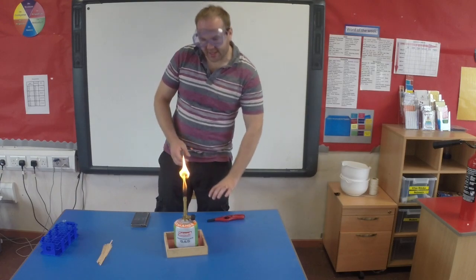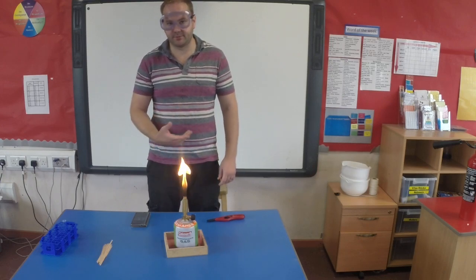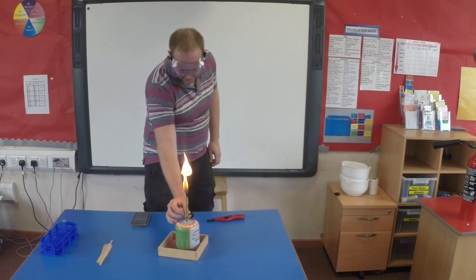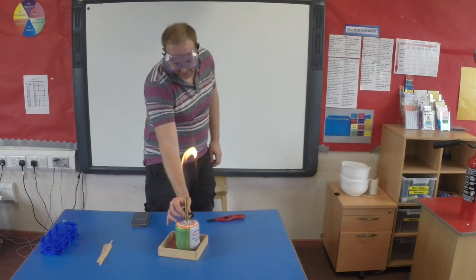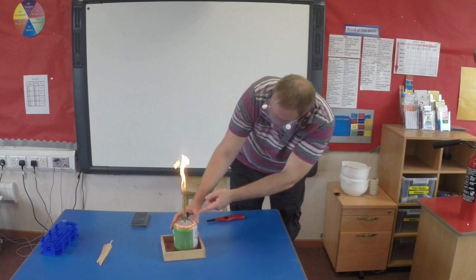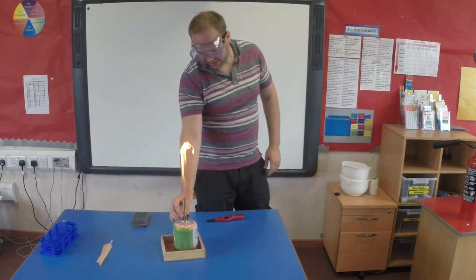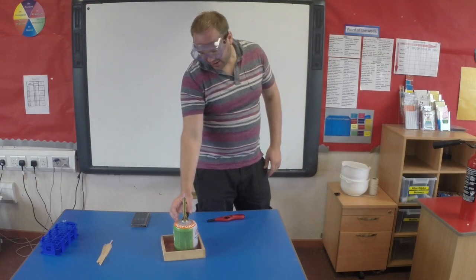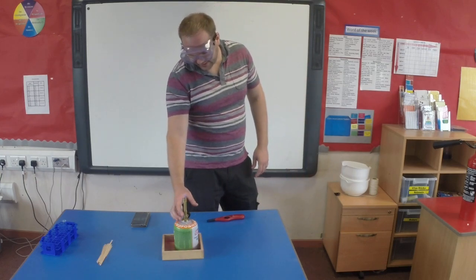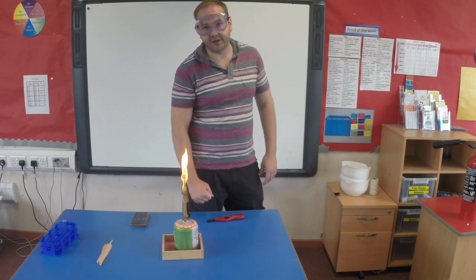If I want to do something that requires a higher heat, if I'm using it for a chemical reaction or boiling something or melting something, what I do, on the side of the burner here, you'll notice, and you might remember this from your own high school science, there's a little ring that we can turn. And what that does is it increases the oxygen flow to increase the rate of combustion and aid in more complete combustion. So we've got now a very hard to see blue roaring flame. So you hear this one but you don't necessarily see it. And then we simply turn it back the other way to turn it back to our safety flame.